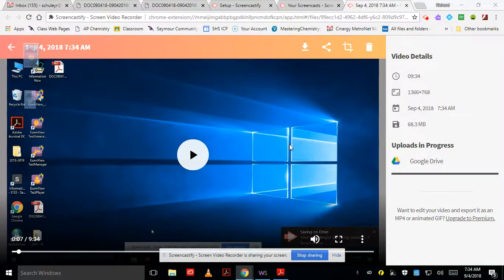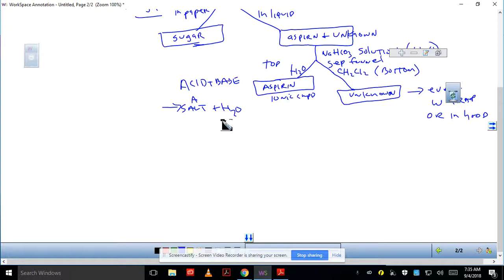Welcome back. This is part 2 of the lab number 2 video, and we were at the point where we were looking at how to get our aspirin back. So then what we'll do real simply is, well, what did we do to this? Well, we added a base to turn it into the salt.